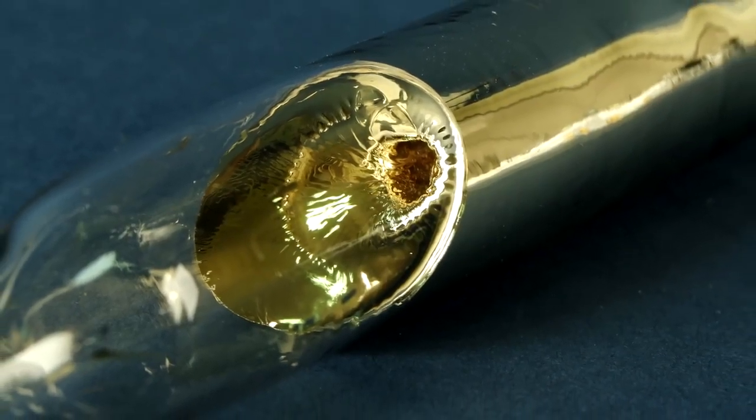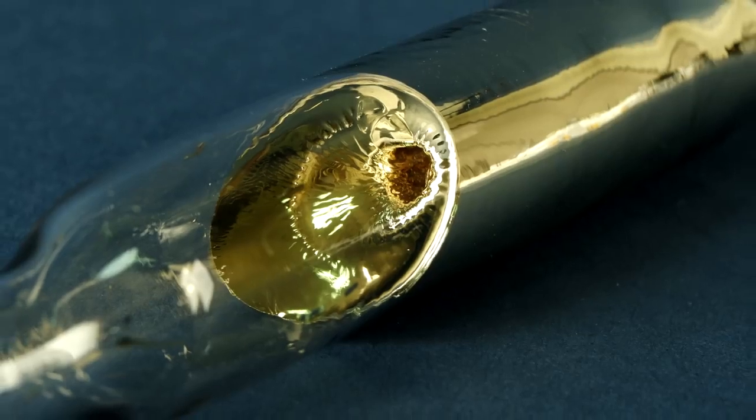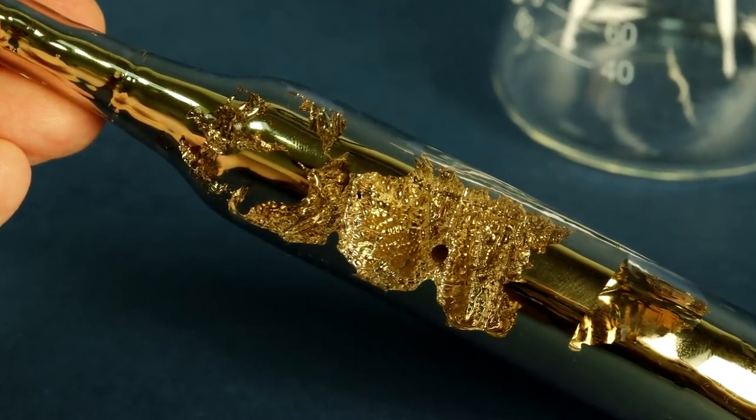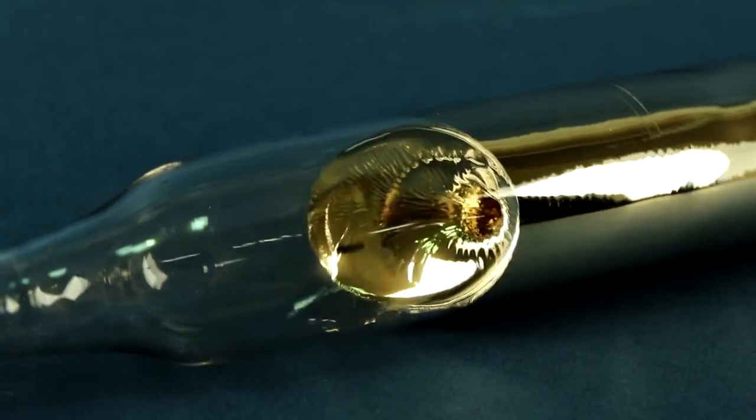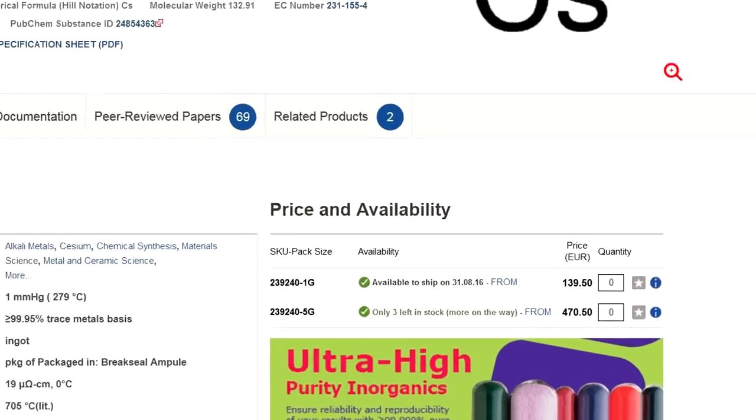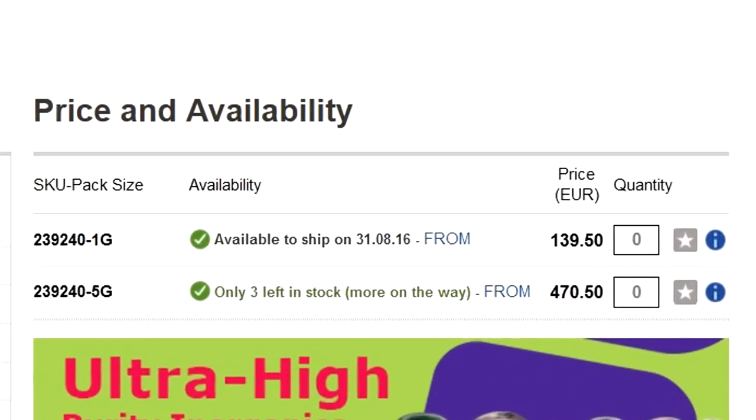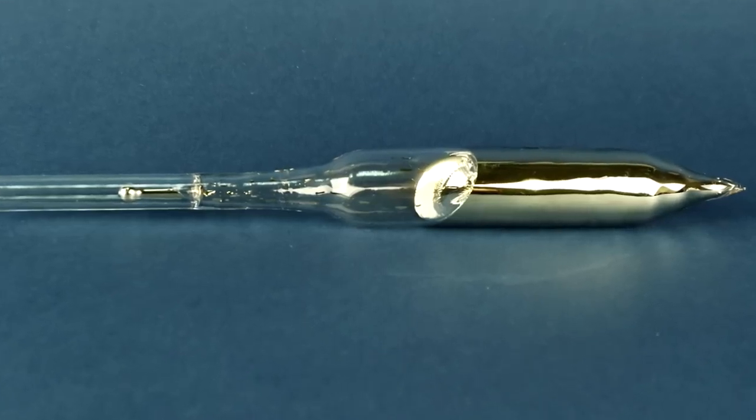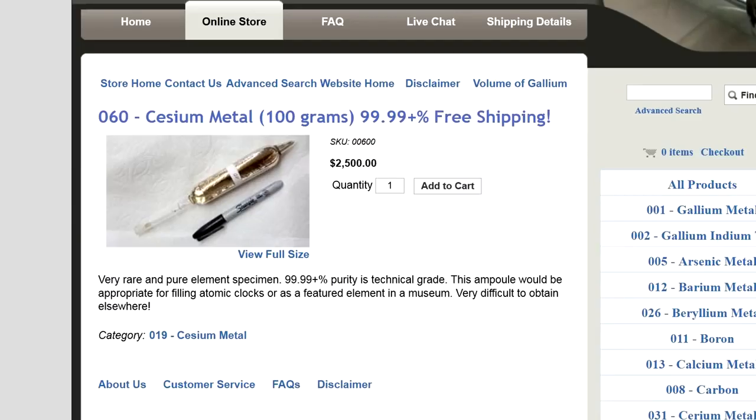Appearance-wise, cesium has a yellowish tint, like gold, but the price for cesium is still higher than gold. Due to the extremely small sales market and its highest activity, price of cesium can reach over 100 euros per gram. The vial which you see on the screen is 50 grams of cesium. Just imagine its cost.